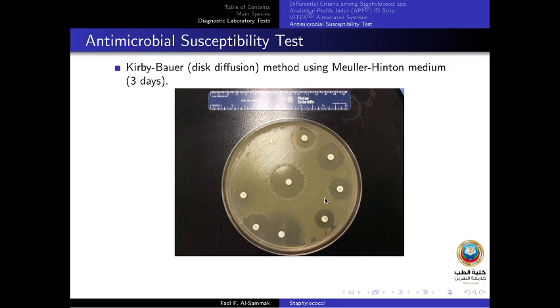First of all, we have to incubate the organisms without the antibiotics. So we require a total of 3 days, because on the first day we isolate and incubate only the microorganisms, and we inoculate the whole plate until all of the plate is inoculated.